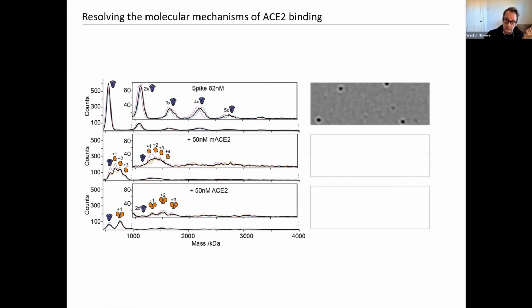What we start to see are these things that we commonly refer to as floaters. Large complexes or aggregates that are starting to form. And when we look at the wild type ACE2, these floaters, aggregates or complexes are much more abundant. And you can see these form. Sometimes they land and interact with the glass surface and stick around. So this is telling us almost immediately that we do in fact have large complexes and cross-linking from the presence of the wild type ACE2.